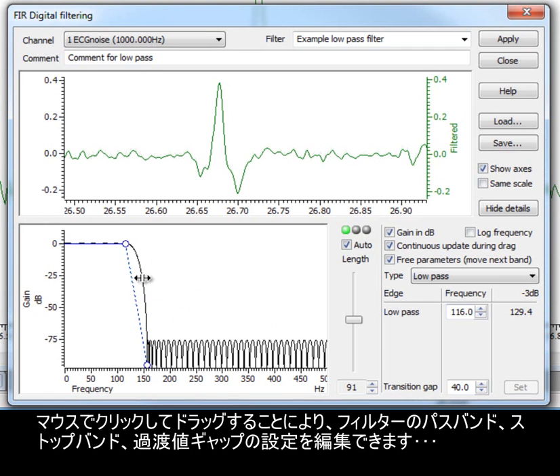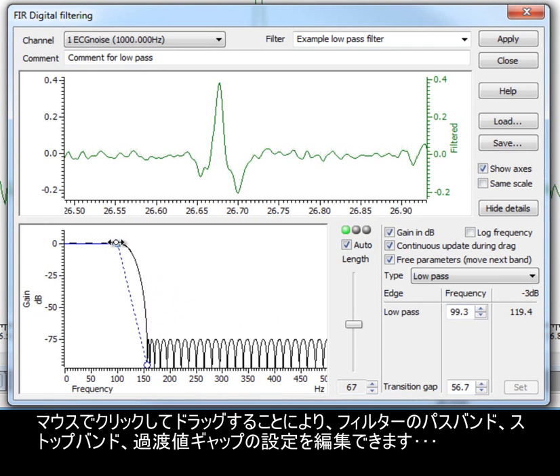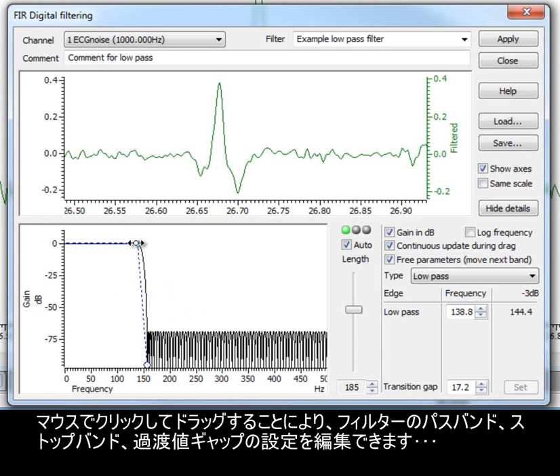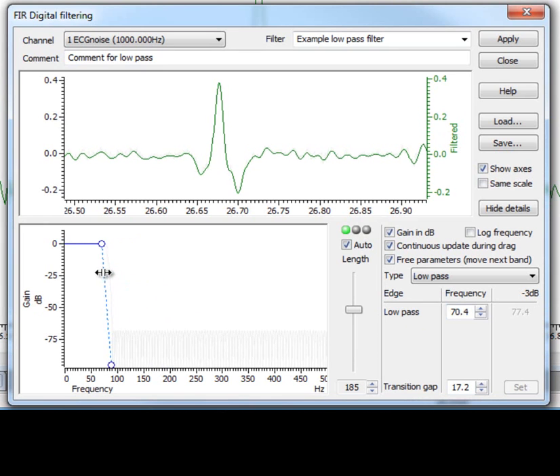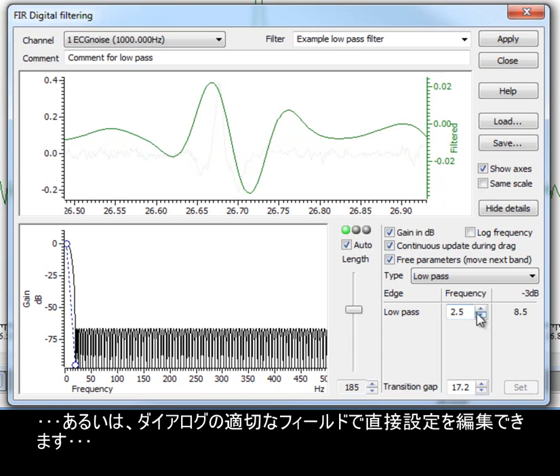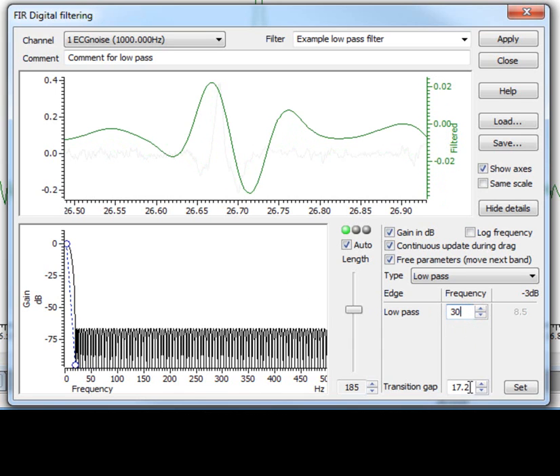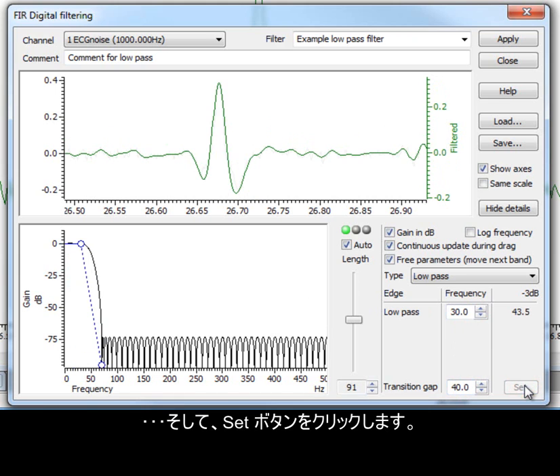Pass bands, stop bands, and transition gap settings of your filter can be edited by clicking and dragging with the mouse, or you can edit the settings directly in the appropriate fields of the dialog, and click the Set button.